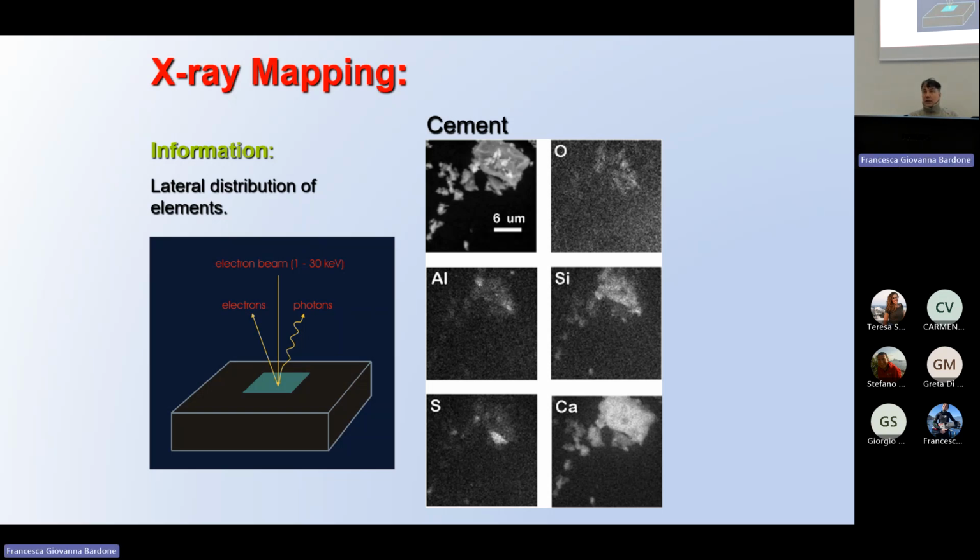So if you have coated the sample with carbon, for example, the carbon coating is interfering with the X-ray analysis of the elements. Yes, not as much as gold, because you can coat with gold, which is much more conductive.